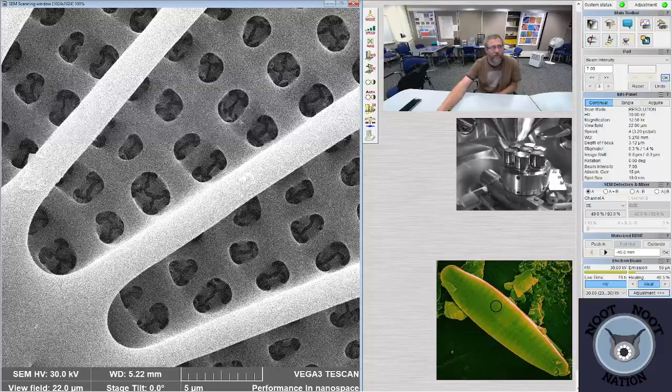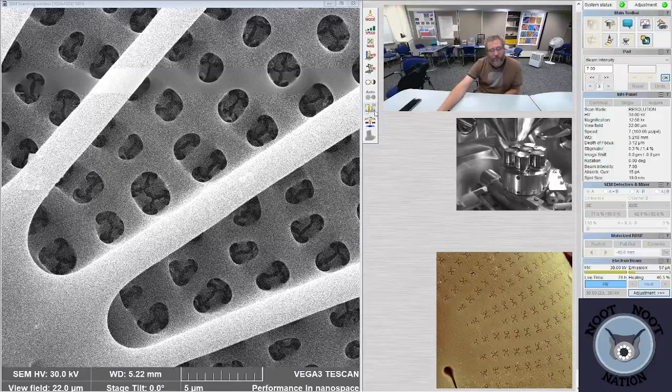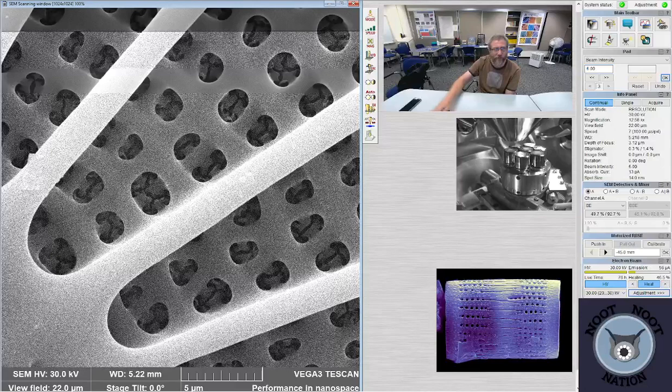Just one like this, so we can see the internal structure really clearly. That's a coffee table photo for you, for the books. That's gonna look good, colorized. Do one like this and then I'll zoom out. Let's see. Let's lower the beam intensity just a little. It'll make this image a bit darker, but it'll pick up just a little bit more detail.